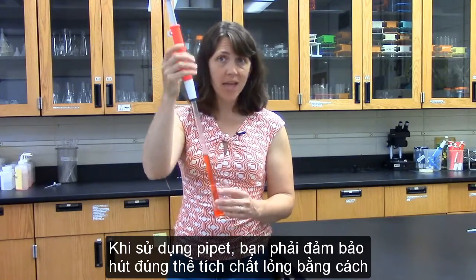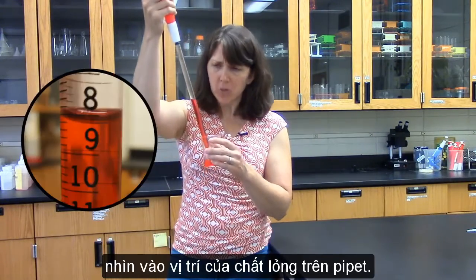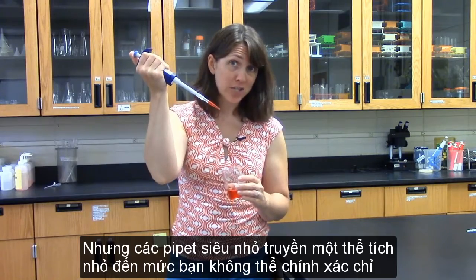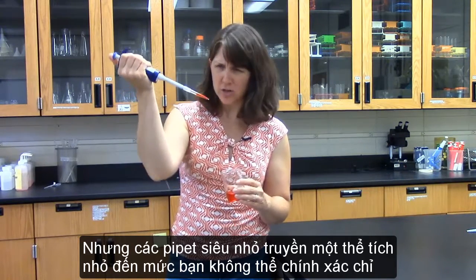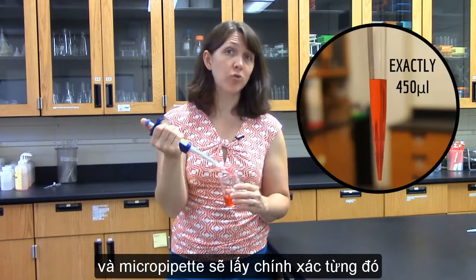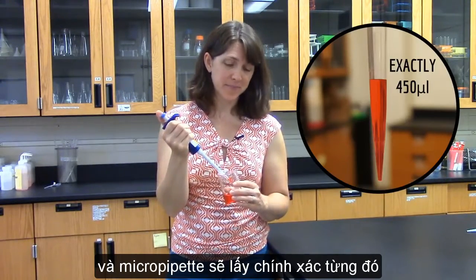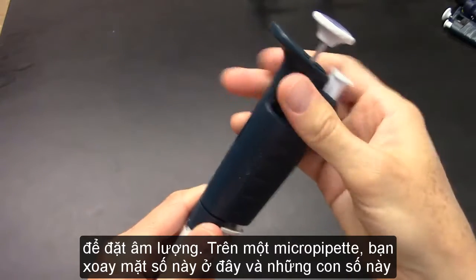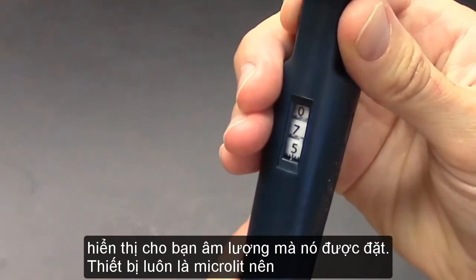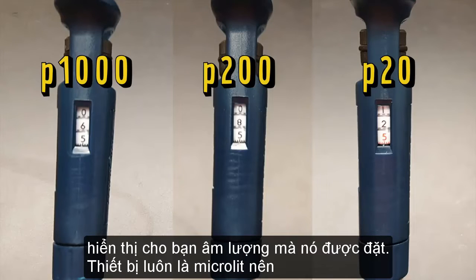When you use a pipette, you make sure to draw up the right volume of liquid by looking at where the liquid is on the pipette. But micropipettes transfer such a tiny volume that you can't be accurate just by looking. So for micropipettes, you set the volume and the micropipette will draw up exactly that much. To set the volume on a micropipette, you turn this dial here, and these numbers show you the volume that it's set to. The unit is always microliters.